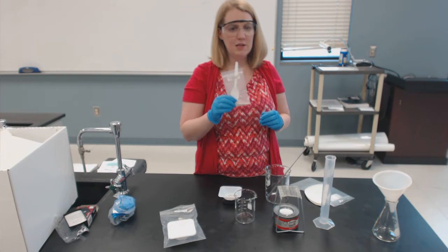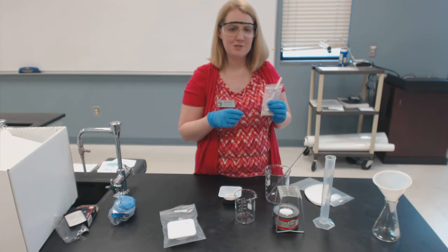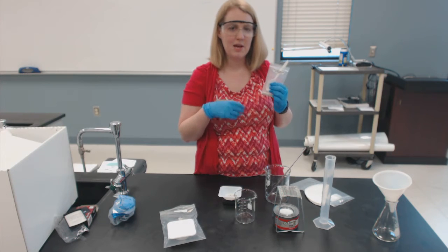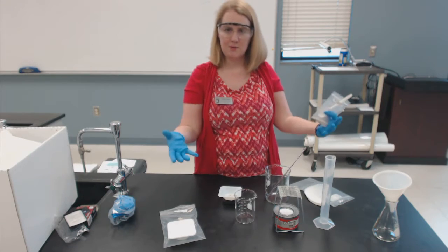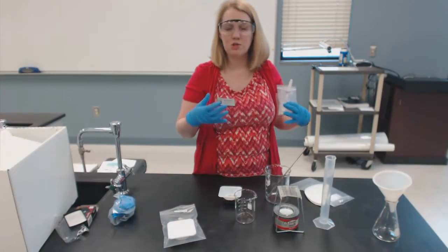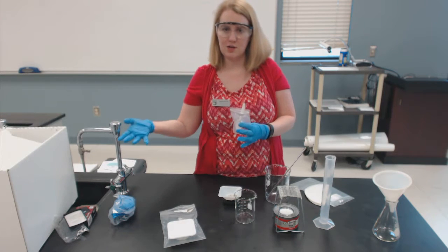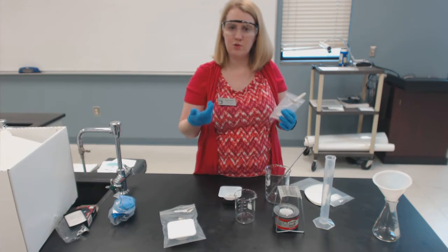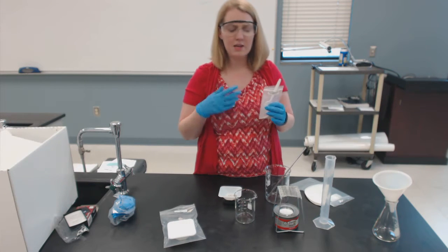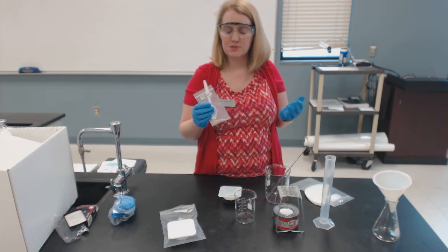The idea at the end of the lab, the main objective, is to determine what the percent composition is of these three components, to calculate it, if you will. So you don't need to actually, in the end, have three separate bowls with the three separate components in it. You just at least need to know what were their masses so that you can calculate the percent composition. You're going to do this for 2 trials, and then compare trial 1 to trial 2 to see if you get consistent results. And if not, be able to explain a possible reason why you didn't get consistent results.